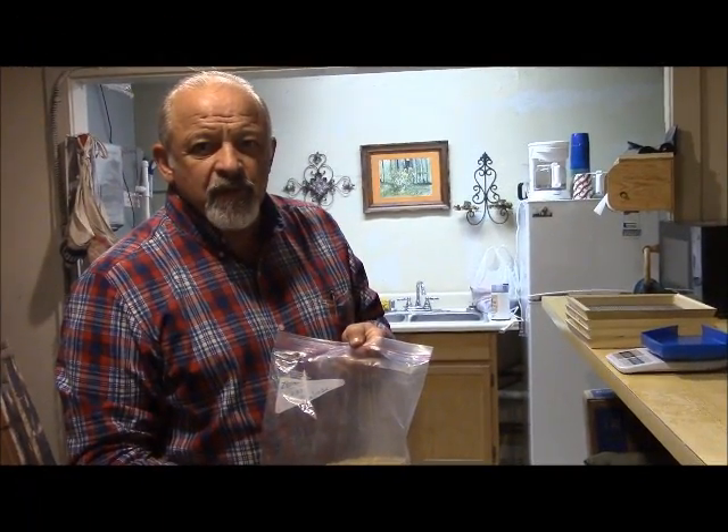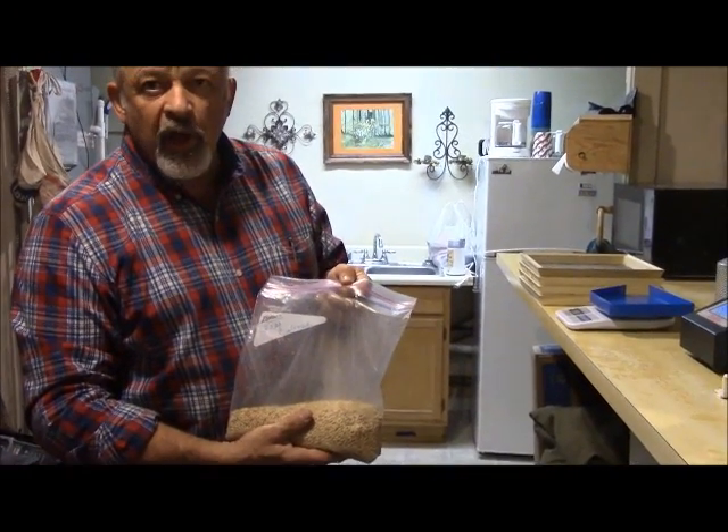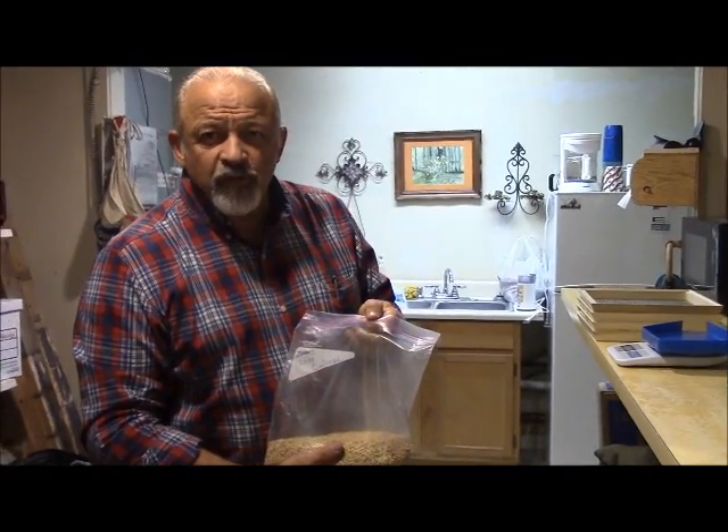Here we are, April 3, 2015. We're going to run a sample of Calrose medium grain rice, 2014 crop.